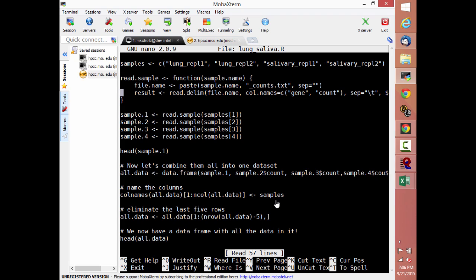There are people who are very, very strongly in favor of one or the other. There's no reason not to. So if you're doing RNA-seq and you see an R file or .R file, it's probably doing analysis in one of those two packages. So what are we doing?